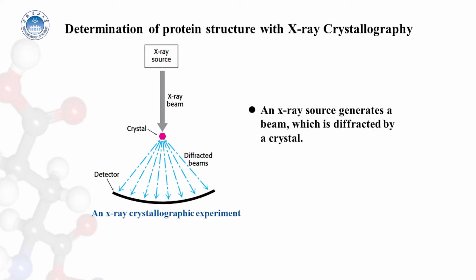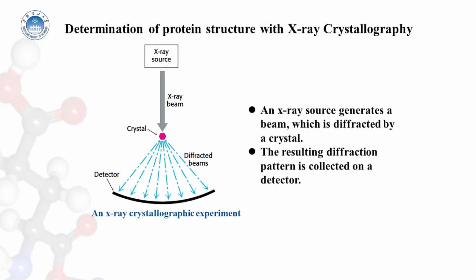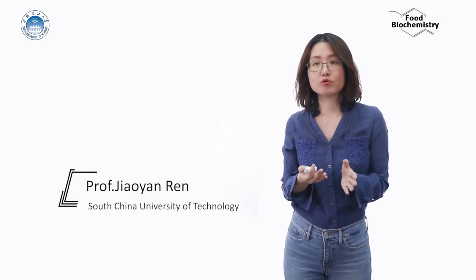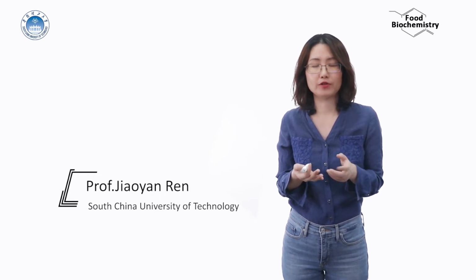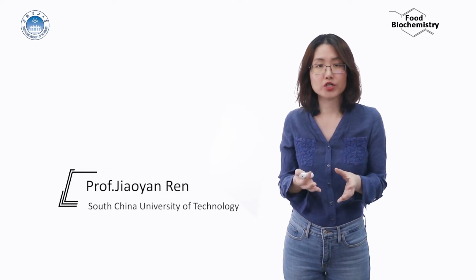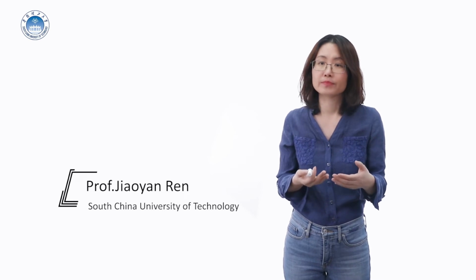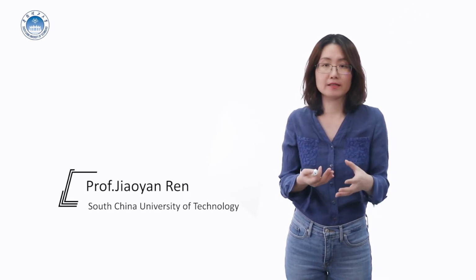conformation of proteins. X-ray crystallography was the first method developed to determine protein structure in atomic detail. This technique provides the clearest visualization of the precise three-dimensional position of most atoms within a protein. Of all forms of radiation, X-rays provide the best resolution for the determination of molecular structures because their wavelength approximately corresponds to the length of a covalent bond.